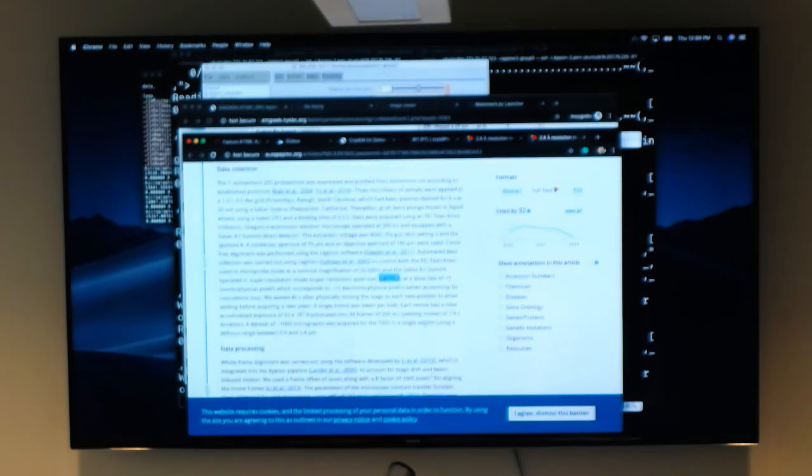Now you know why we like Leginon. This gets a little more confusing because someone published some data, and great, now I have their data, but you still need more information than just the raw micrographs. This is just giving you a clear example of why certain pipelines are fine; it's just that you need to do more or less bookkeeping depending on which workflow you use.